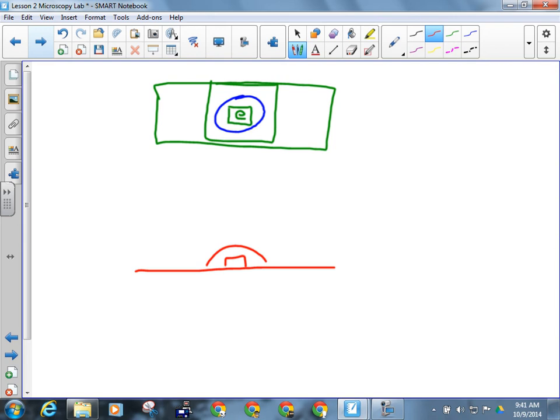It's a little square piece of plastic, and what you're going to do is lean it at an angle close to where your letter E and the water are, and then just let it fall. It'll come down and squish the water out, kind of all around the sides, and then it'll stick. The water makes it stick somehow. Now you can view that underneath the microscope. Just stick it on the stage, inside the stage clips, and start focusing. So that's how you make a wet mount.